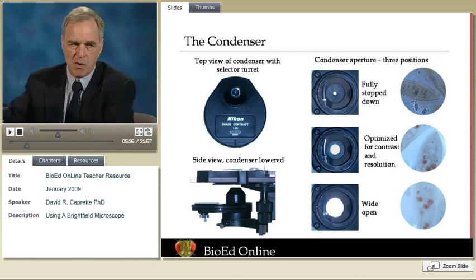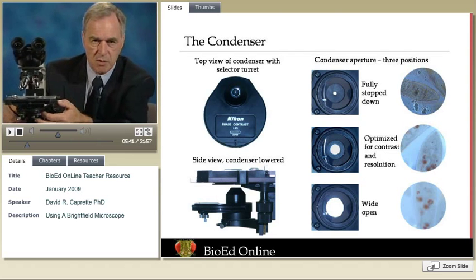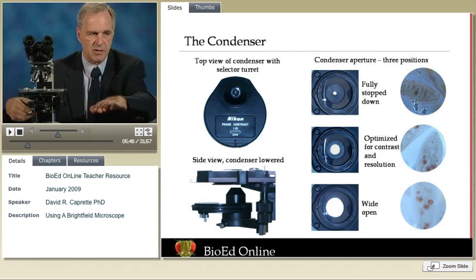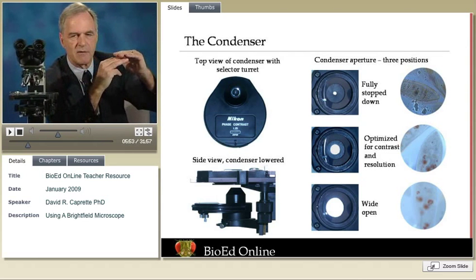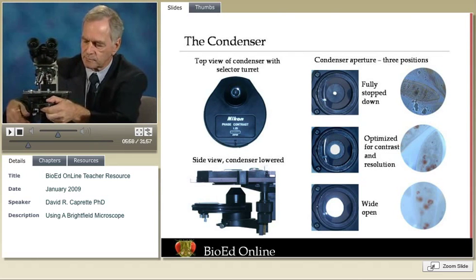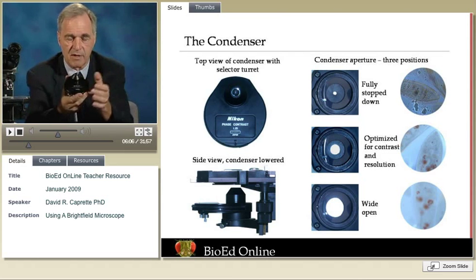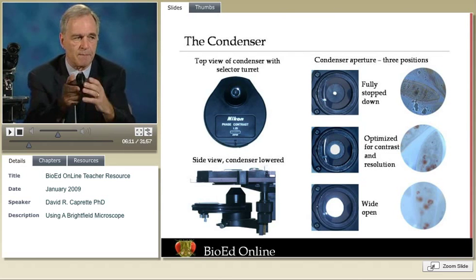The condenser has to be adjusted as well. If you have an adjustable condenser — which most student microscopes don't, but if you do — make sure it's in the proper position. If the condenser is down away from the stage, you're not going to see much at all. It has an optimum position, usually within a few millimeters of the stage opening. A lot of condensers look different. Most are round and all of them have a condenser lens that you can identify. They vary in shapes, sizes, and mounting methods.